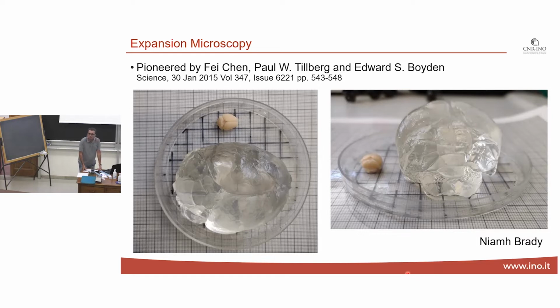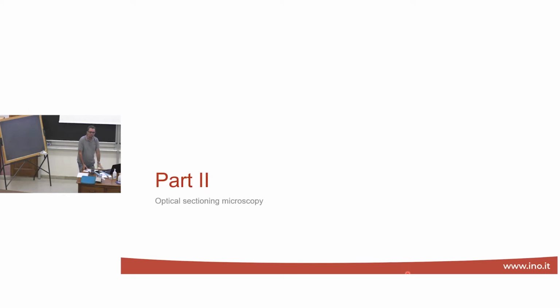So this is what people did. Instead of increasing resolution, let's make the sample bigger. Anyways, now we move to the second part. I will show you some details about the actual instruments, the techniques that we use to do optical sectioning.